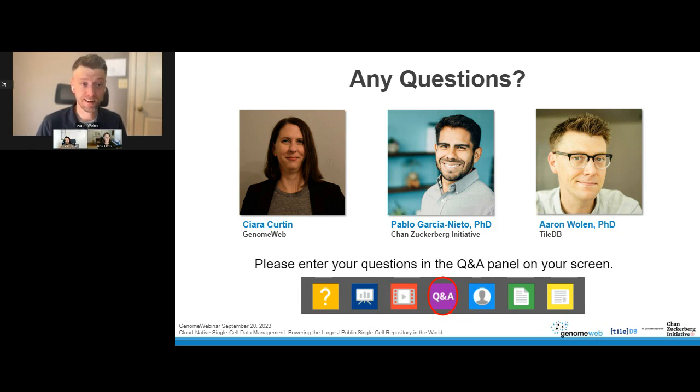Of course, there are additional formats that we very much would like to support in the future. And this is where community feedback is really important to us. So if there's a format that you're using regularly that you would like to see supported by way of an ingester or an exporter, please let us know by opening an issue on our TileDB-SOMA repo.